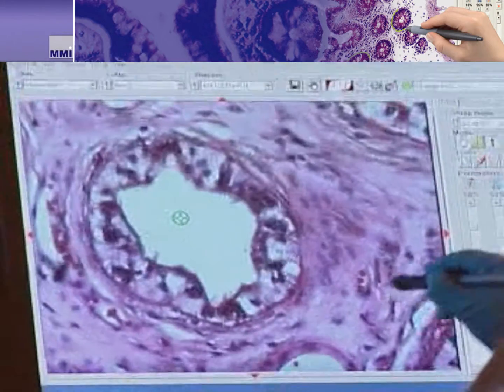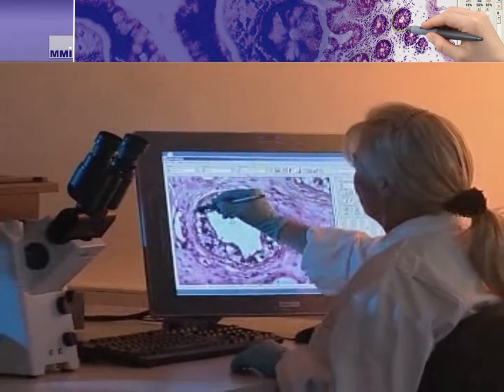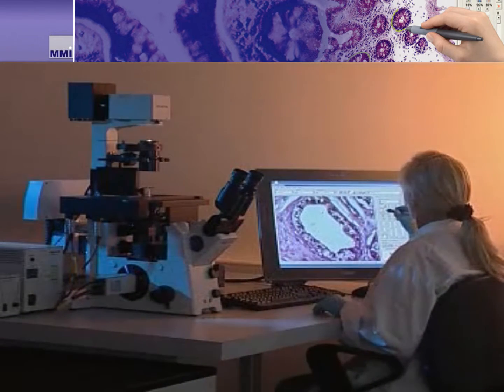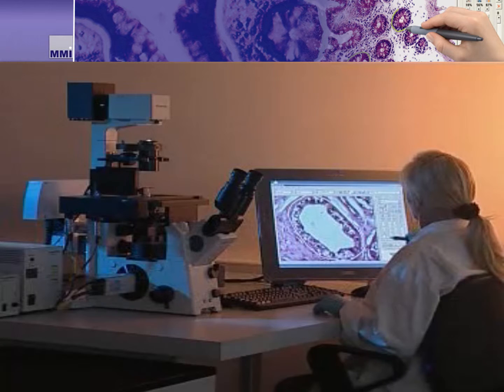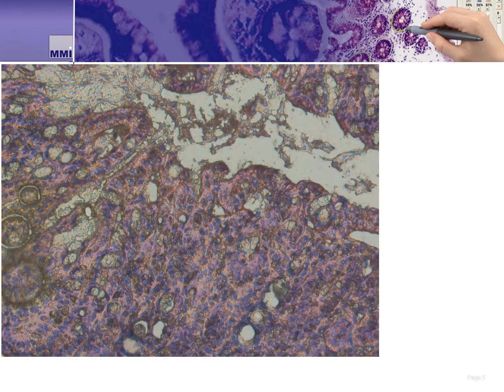In this case, we see an end user using the system's touch screen and light guide pen to navigate the tissue mounted on the microscope stage. We then see her decide on an area and circle it with the pen — you can also use your mouse to do this. The selected area is the area to be cut; the line she drew is the cutting line the laser will trace. Now we'll see how the MMI CellCut quickly cuts two regions of interest from the tissue — it is very fast.